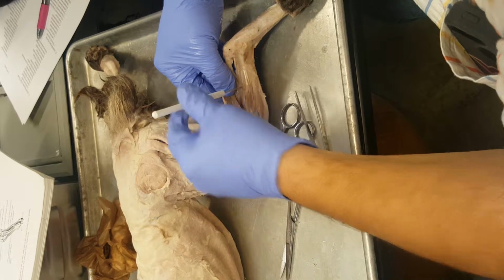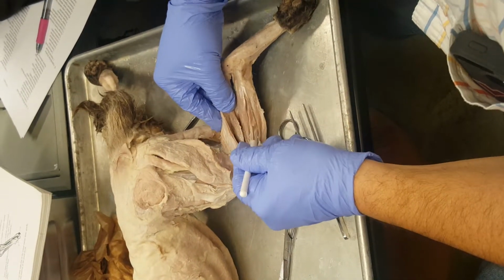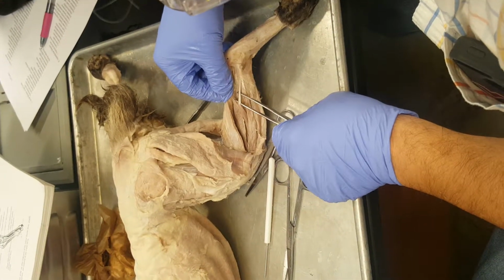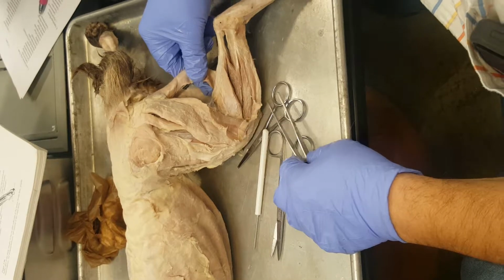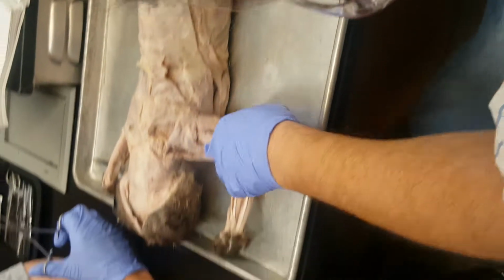There's your peroneus brevis. There's your peroneus longus. And the third one in between, the little twin, is the peroneus what? Tertius. And then this is your semimembranosus. That's one of your medial hamstrings. We'll get to the other ones later when we go deep. So we're just doing superficial stuff right now, by the way. There's deep muscles. Okay, watch yourself.